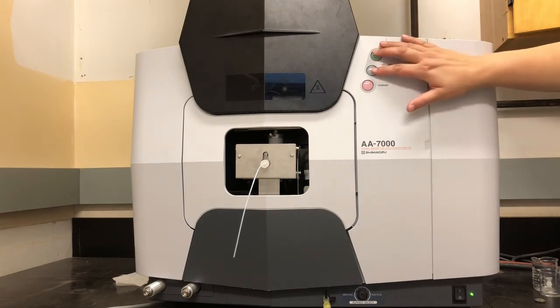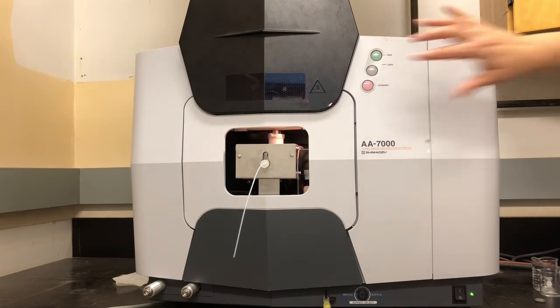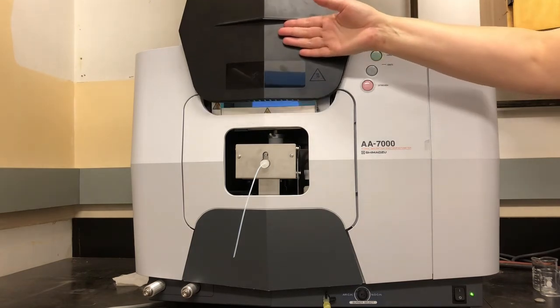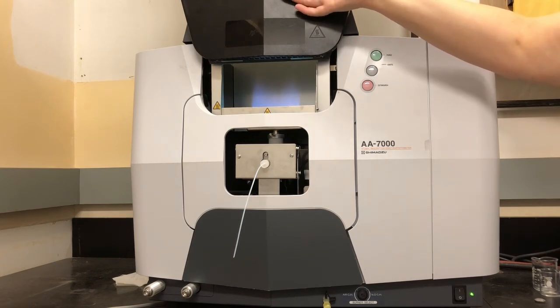So to light the flame, we hold in on the green and gray button at the same time until our flame ignites. And we can hear it ignite. Okay. So it has a safety shield covering it, but if I lift it up, you can see we have a nice clean flame there. So the flame should be mainly blue. We'll see little flickers of orange there, but it should be a nice, clean, hot flame.